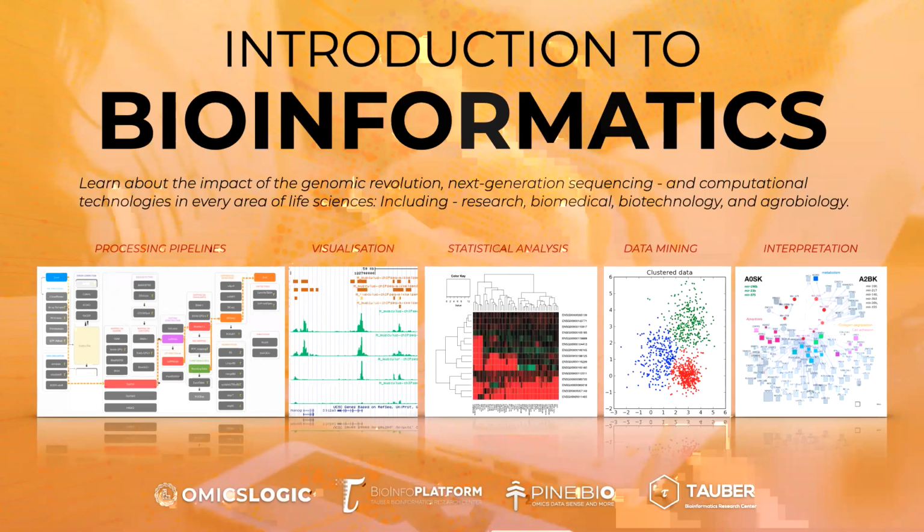The Introduction to Bioinformatics course is designed to give you a high-level overview of different techniques that will allow you to study biological phenomena by analyzing next-generation sequencing data. So when we speak about omics data, we talked about processing. Today we'll talk about the analysis, and then we'll also see how interpretation of these patterns could be available for biological insights in different types of projects.